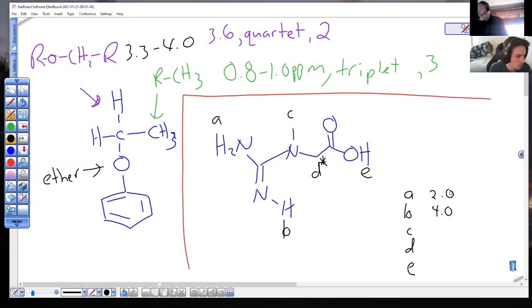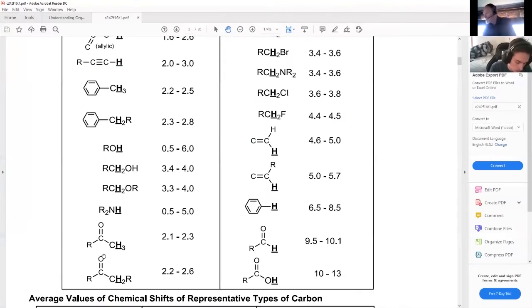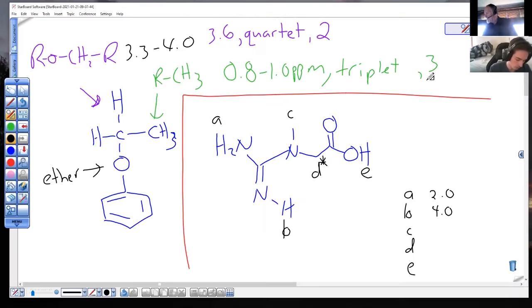We'll just do where's the peak for now. Now here we have an H for C here. We have an H on a C on a nitrogen. Let's look for our closest match on the table there. H on a C on a nitrogen. See that? Yeah, right there. So 3.5 is a nice number, isn't it? Yeah, 3.5 for C.